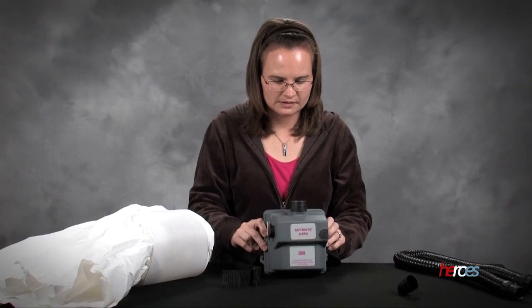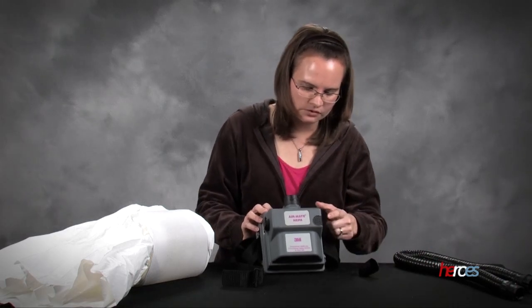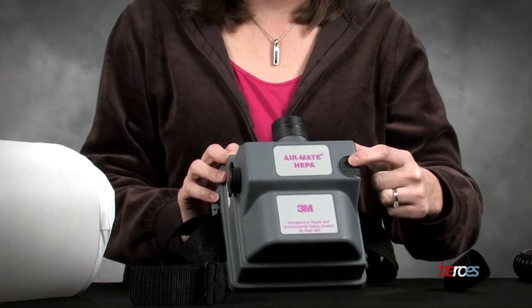Once the filter is in place, we can go ahead and test the PAPR power. To do that, first we need to find the PAPR's power button, which is right here.